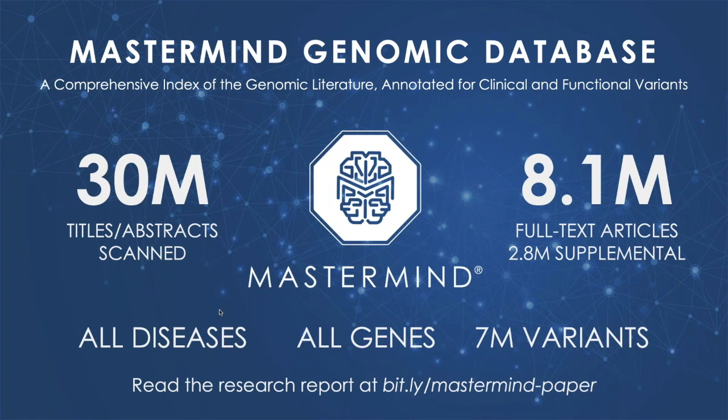But obviously, as Dan went through in his examples, we go much deeper and index the full text of those prioritized references that have genetic, genomic, or human disease related content. And we keep that up to date on a weekly basis. So to date, we have more than 8 million such articles that look for those components that Dan had described: the diseases, the genes, their variants, and a handful of other aspects that are useful for interpreting the meaningfulness of this content. The indexing of the full text articles includes figures and tables, which can be particularly challenging given the complexities of the data display and the way genetic variants are described in those references.